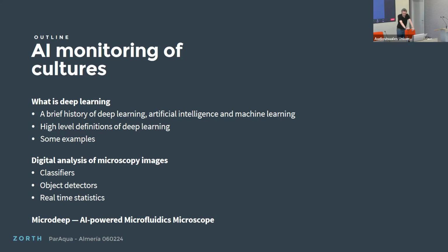I was coding it myself, and that was 9 years ago. That was for detection of Plasmodium falciparum, the malaria parasite, in blood smears. I'll give you an example of this type of technology today.